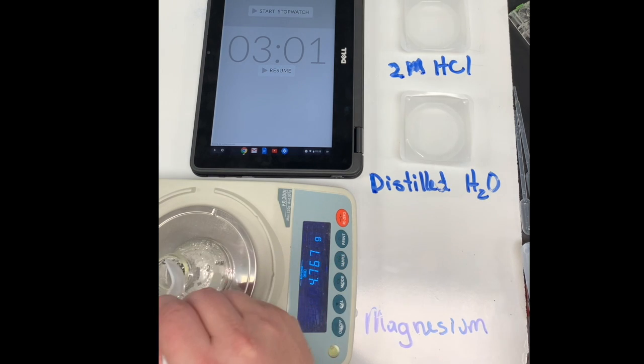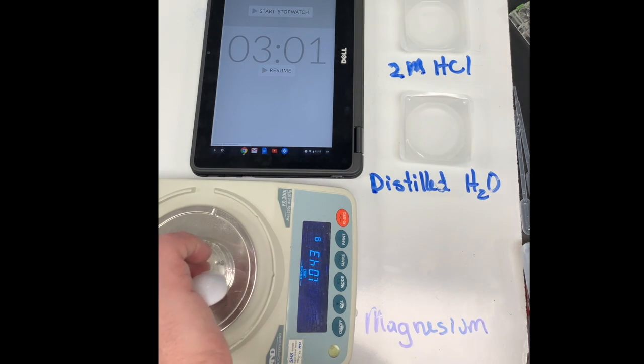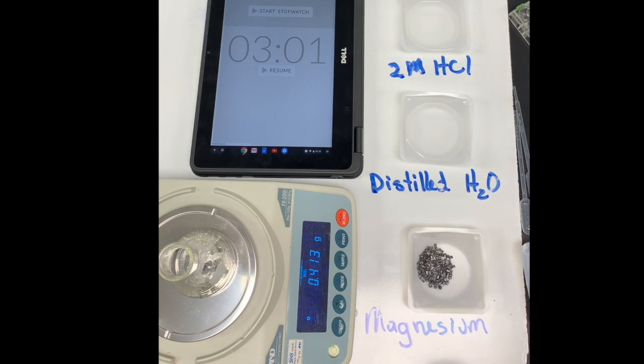We're going to add some magnesium to our flask. We'll swirl it down there to the bottom, and then we're going to start with 20 milliliters of 2 molar HCl and we'll measure the change in mass over time.